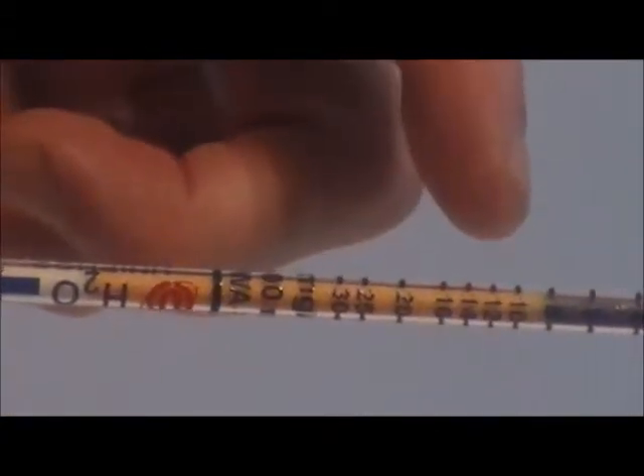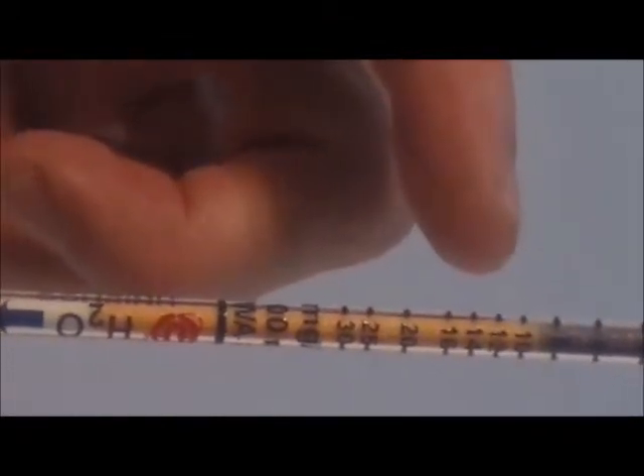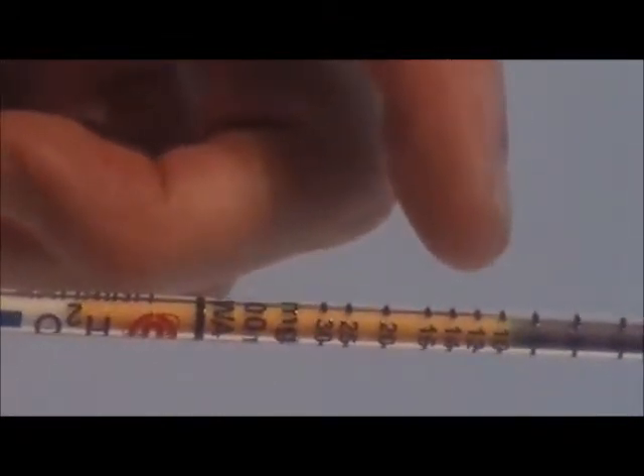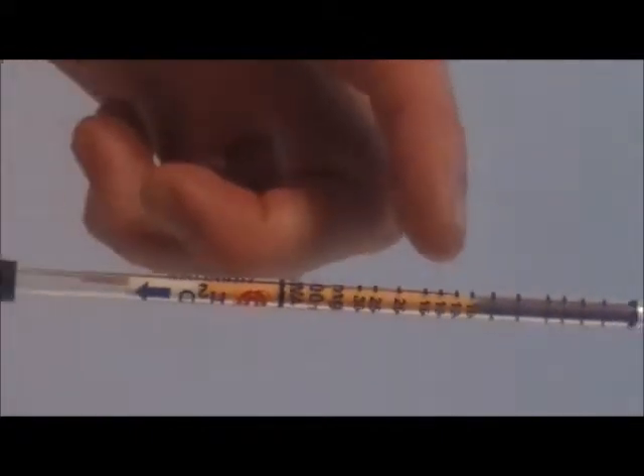At the end of the sampling time the stain length stops and the concentration is read from the length of stain. In this case the stain seems to be ending at around 10 milligrams per liter.